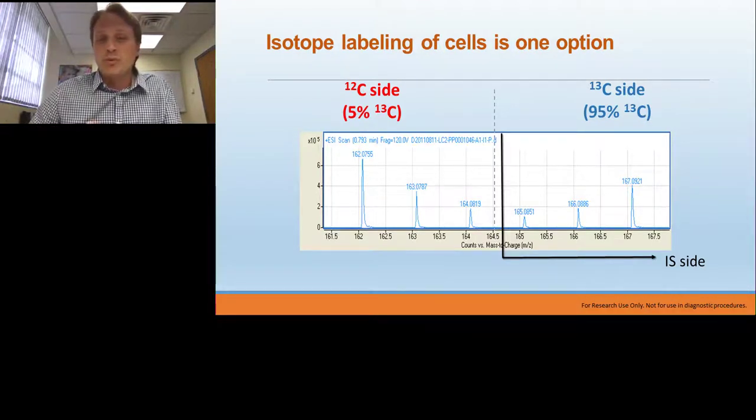So what I sort of tell people is it represents the DNA of a metabolome, because now we're producing things that are not natively present, and we can easily capture and identify metabolites that are isotopically labeled through glucose in a given system, and then match those with the carbon-12 side as a way to measure the single metabolite with both an internal standard on the right and the natural abundance on the left.